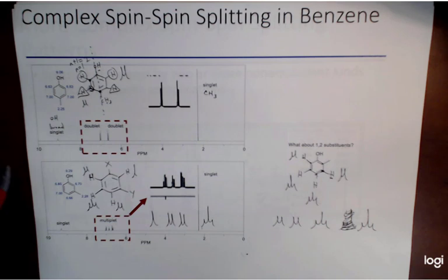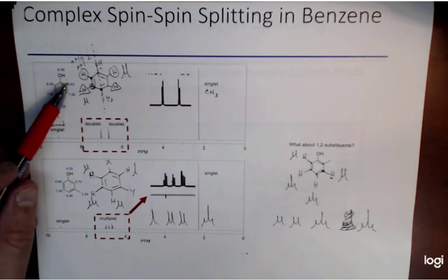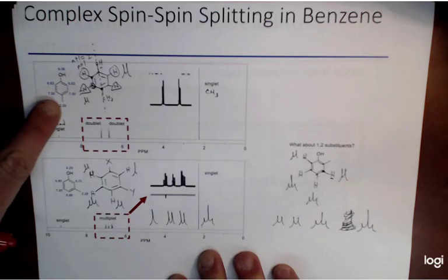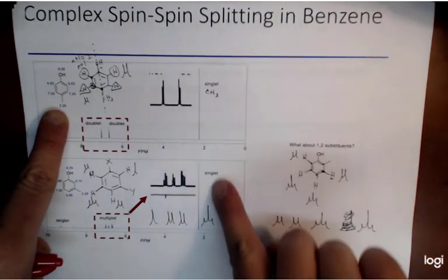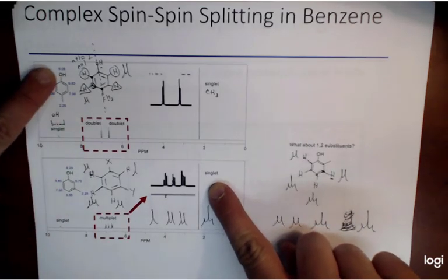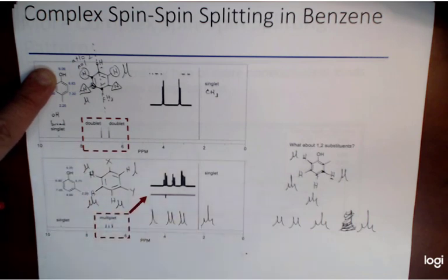And the interesting thing here is when we look at the hydrogens bound to the aromatic ring, the benzene ring, it can tell us a lot about how those two groups are structured and how they are attached to the ring. So when we look here, this CH3 will always give you a singlet, that singlet right there around 2.2. Your OH is always going to give you this broad singlet.